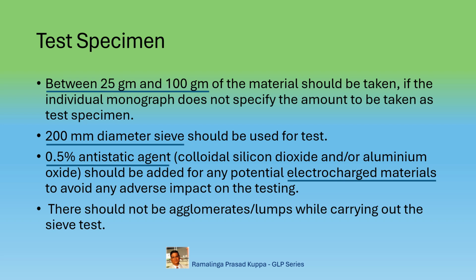There should not be any agglomerates or lumps while carrying out the sieve test. So before carrying out the test, it is necessary to see that there are no hard agglomerates or lumps in the specimen.